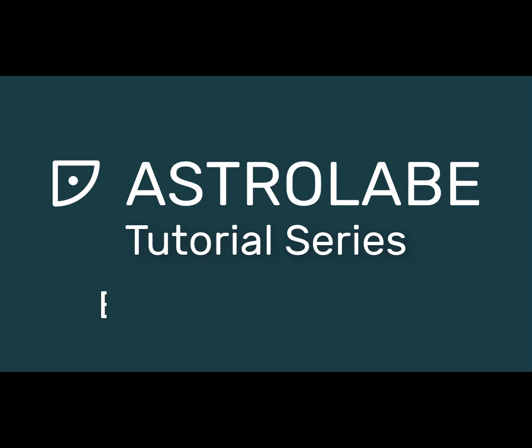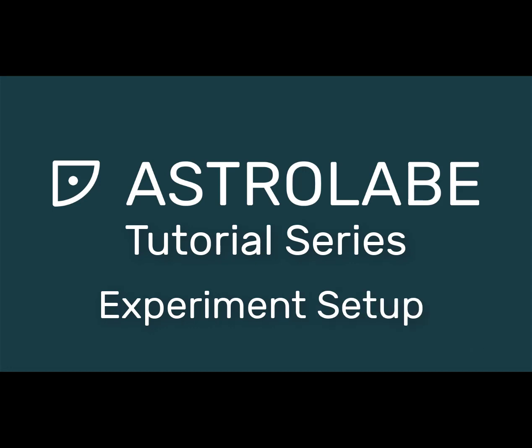In this video, I will show you how to set up a new experiment. But first, just a quick note. We are constantly developing new features, so the current interface may be slightly different from what you see here.